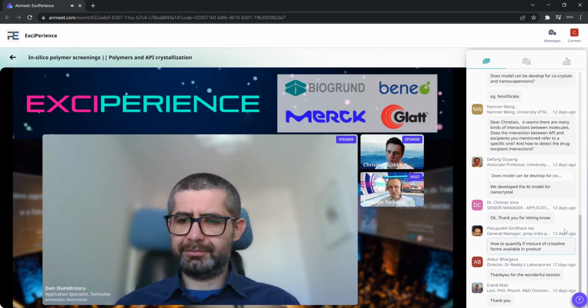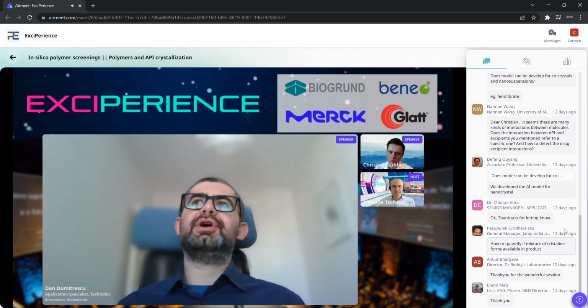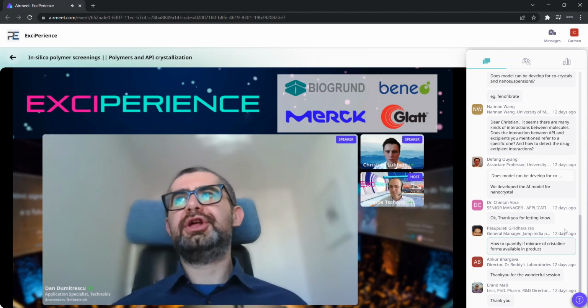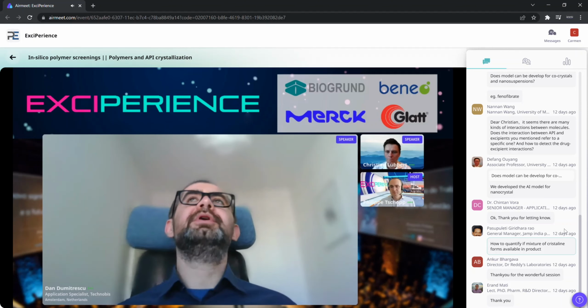Okay, and then I have a question for Dan from Ankur. While using polymers or resins in crystallization process, can the same be done by using solvents, oils, or other liquids? So you can use other small molecules as crystallization inhibitors, for example, or as additives for controlling particle size and shape.